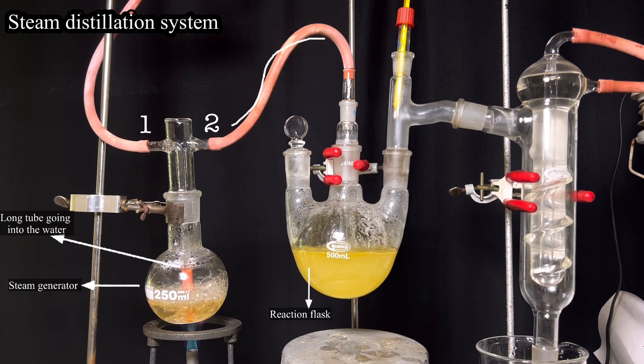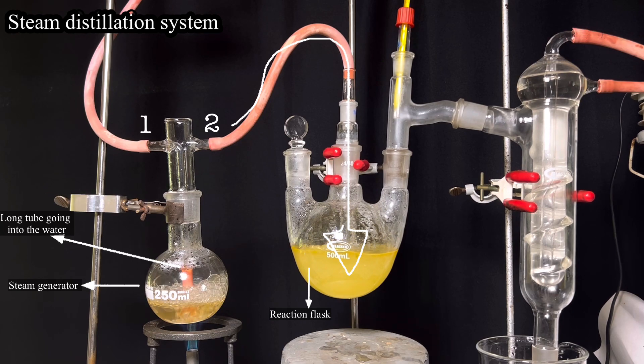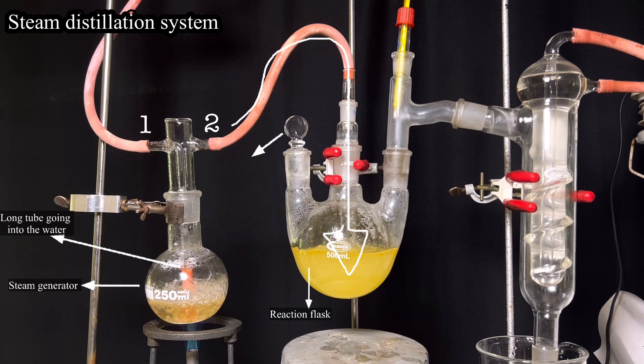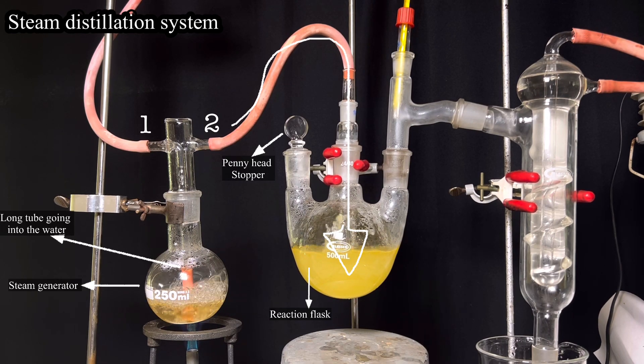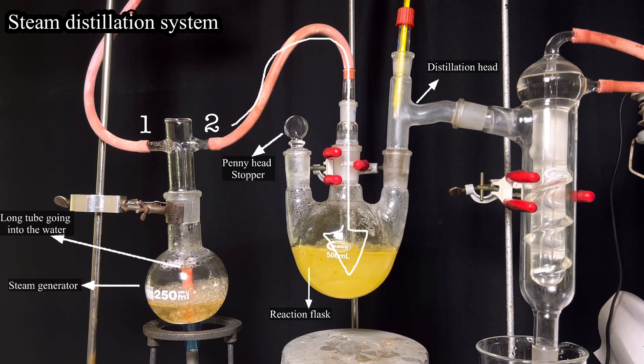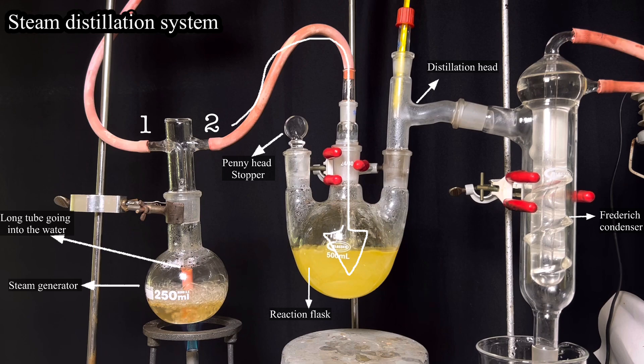Steam travels through the tubing to the reaction flask through its center neck. The center neck has a long tubing inside which goes into the contents of the flask. The left side neck was closed using a solid penny head stopper. On the right side, we have the distillation head and a thermometer. A Friedrichs condenser was also connected to the distillation head.